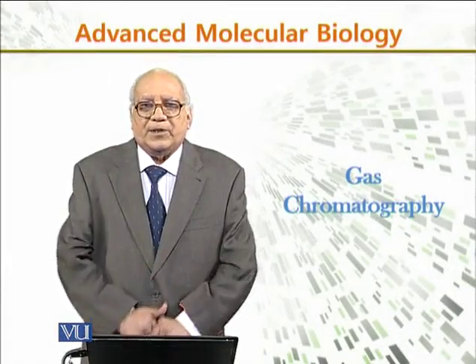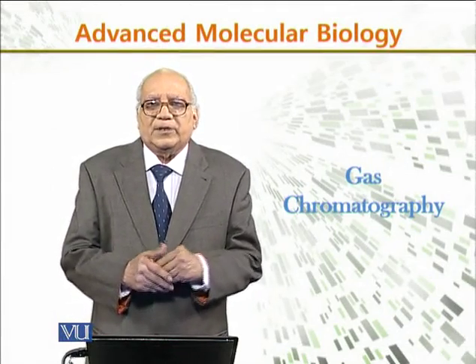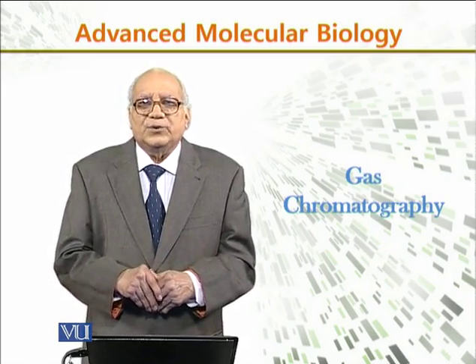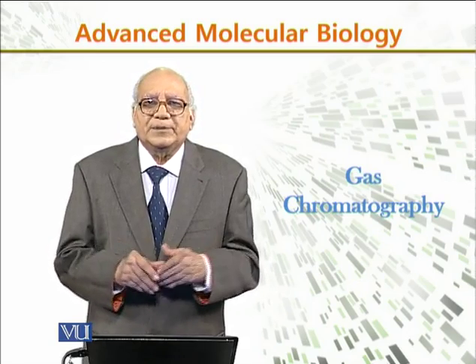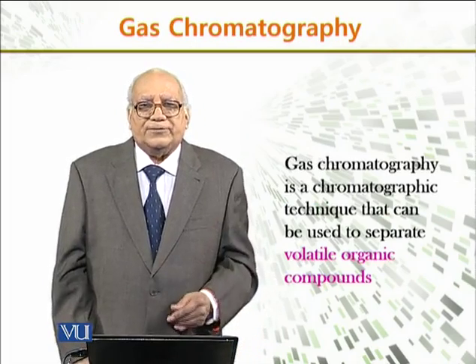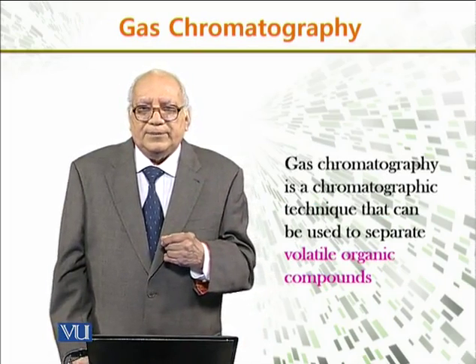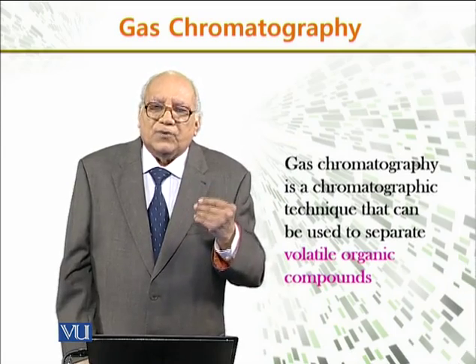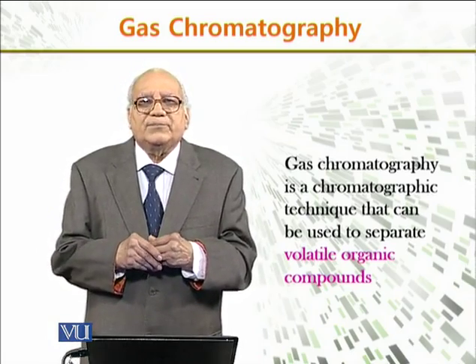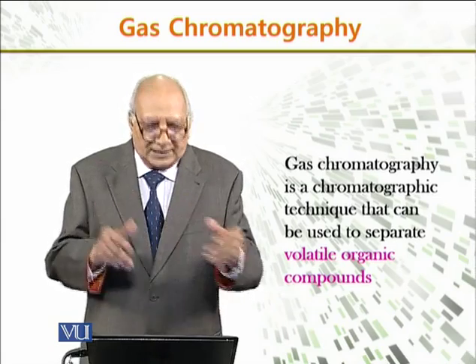One of the most important and very commonly used chromatography techniques in molecular biology, or for other analytical purposes, is gas chromatography. Now, gas chromatography is a chromatographic technique that can be used to separate volatile organic compounds, as the name implies, that is, organic compounds which are volatile.